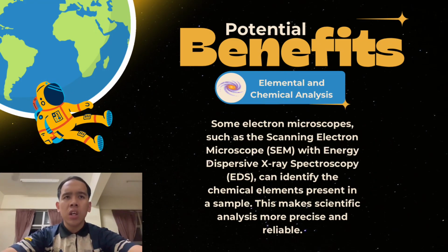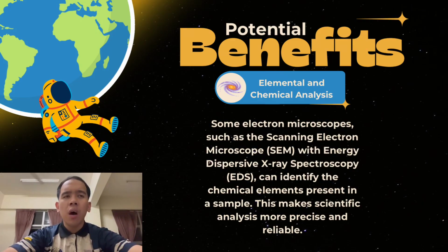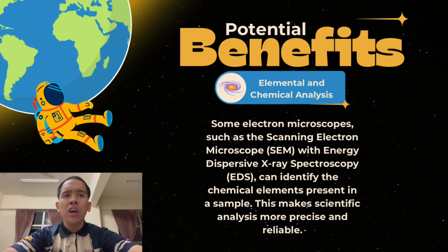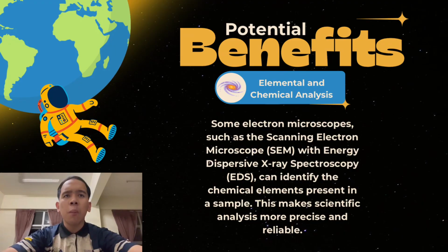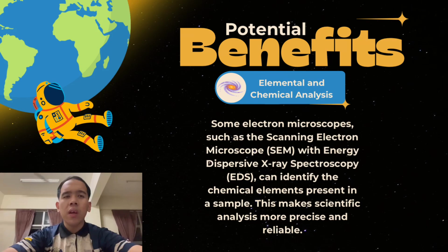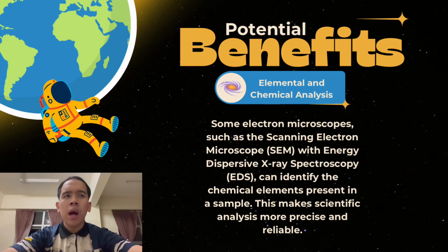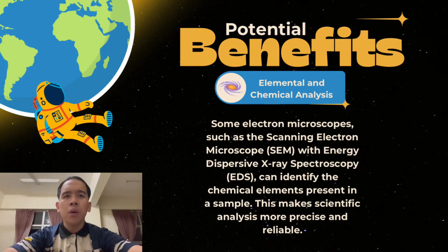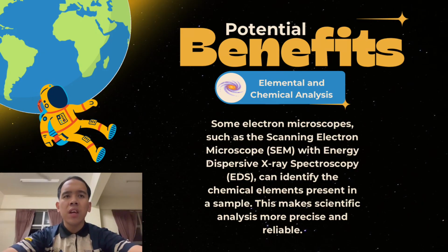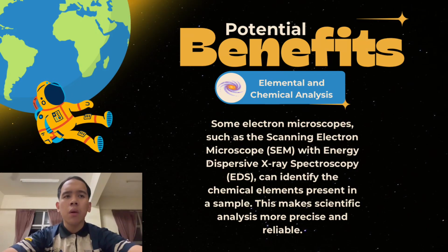Another advantage is elemental and chemical analysis. Some electron microscopes, especially scanning electron microscopes or SEMs equipped with EDS technology, can identify the chemical elements inside a sample. This makes scientific investigations more accurate and reliable.